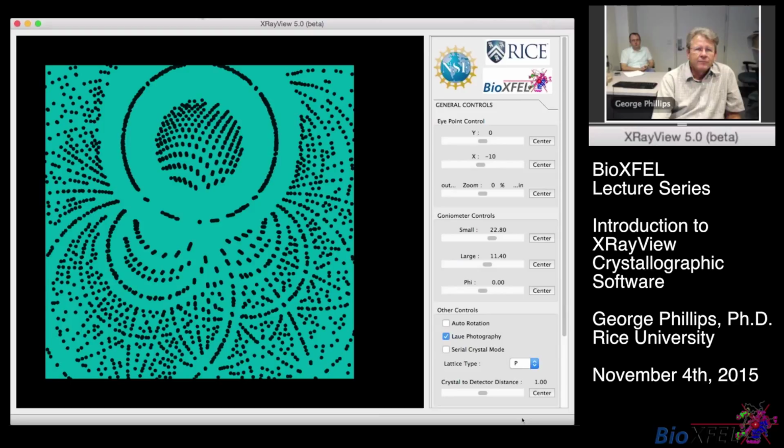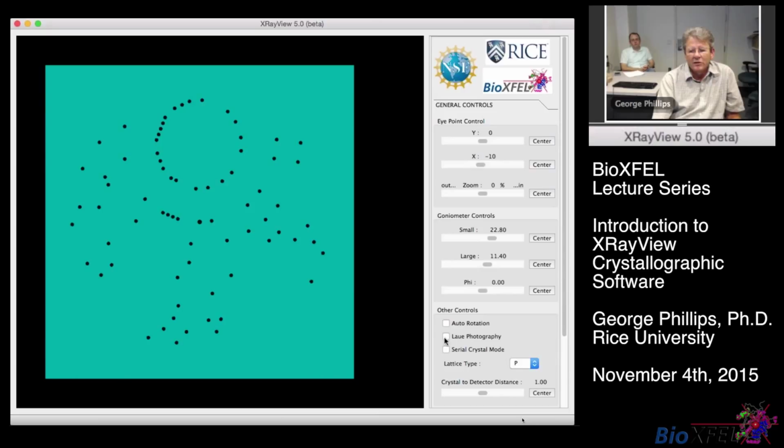If you want to pursue this more on your own or consider using it for teaching purposes, you can. There are a number of exercises here that you can go through. We haven't added one yet for SFX, but that's next. This is version 5.0 beta. We're not quite ready to release it yet, but we're using some of our BioXFEL resources to update it and include serial femtosecond crystallography.